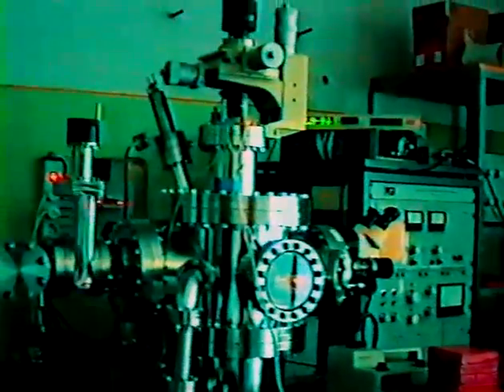It has started just a few weeks ago. So STM, scanning tunneling microscopy, is very helpful to investigate what happens on the surface on an atomic scale. It would be of great help if we can see the atoms or adsorbed molecules themselves with the help of this one.